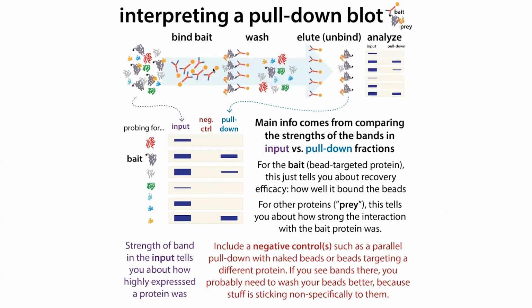And so remember, the wash step is basically when you have your protein bound, then you're washing things off that aren't bound. And these are going to be your wash buffers. Also, you're going to pre-incubate the beads with them. So before you actually add your mixture, you're going to get these beads acclimated to the wash buffer.